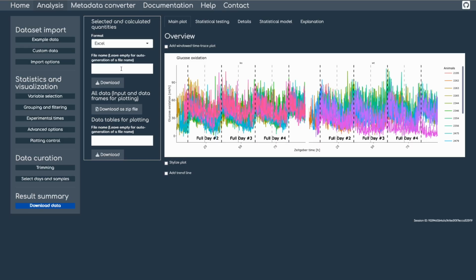That was our short introduction into the Shiny-Calorie app features. We hope you enjoyed it and happy analyzing.